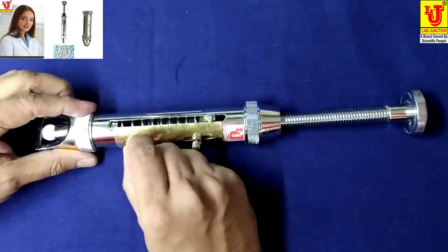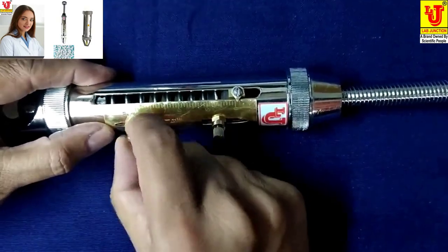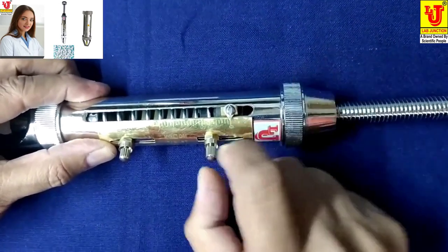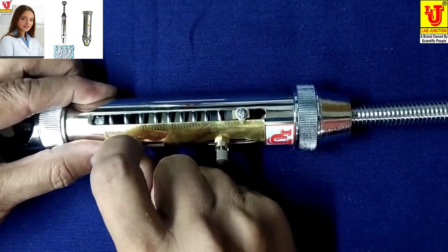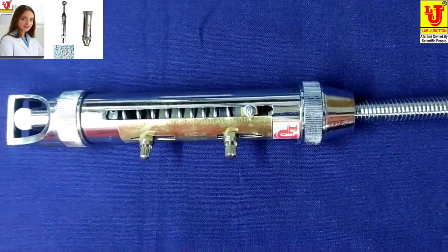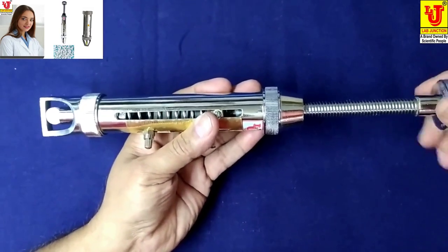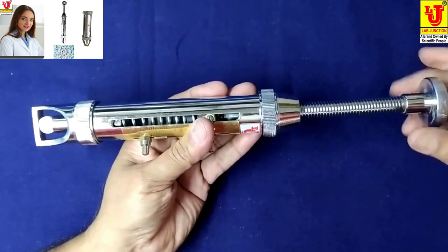Now adjust your scale to 0. You loosen these screws and set your scale to the 0 mark. Now give pressure to the tablet. The hardness tester forces the tablet.